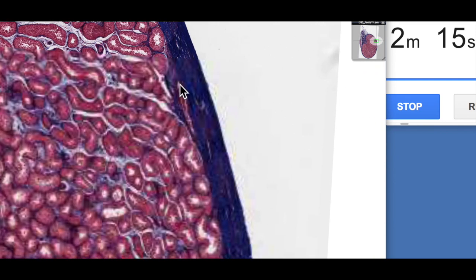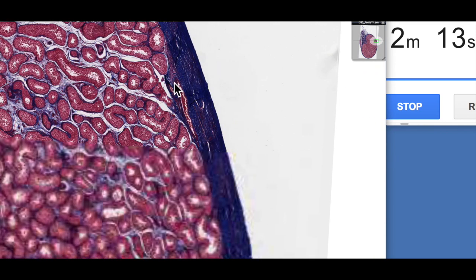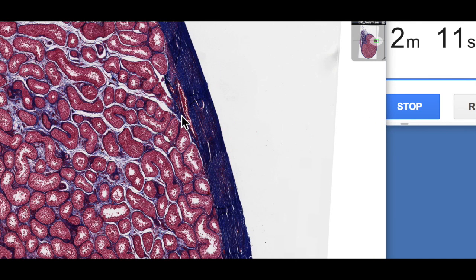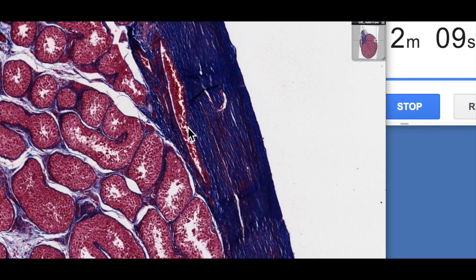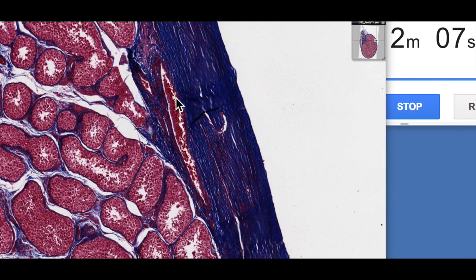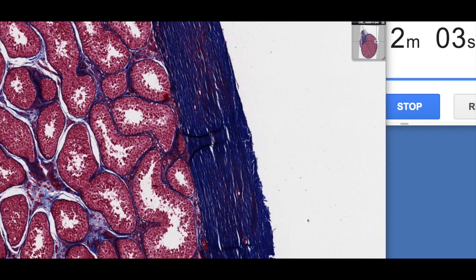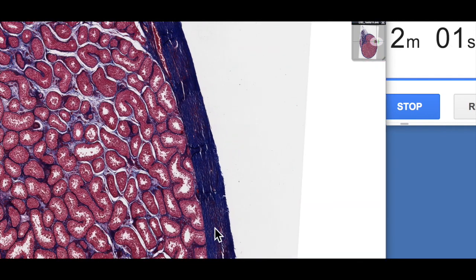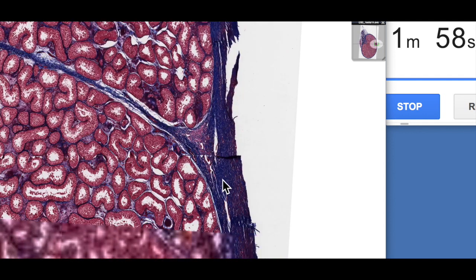Now immediately beneath this layer, this tunica albuginea, is a layer known as the tunica vasculosa. Vasculosa means blood vessels. So here you can see a blood vessel in another section over here. And if we zoom around we can actually see a number of these smaller blood vessels and larger blood vessels.